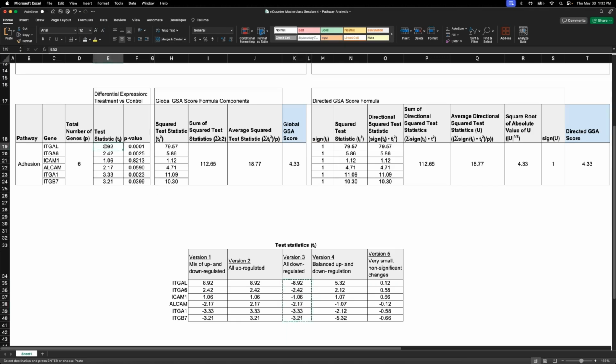So let me paste this in and show you. In this case, they're the same, but the signs are switched. So you remember the global score is independent of whether the genes are upregulated or downregulated. It just looks at all of the genes and says how much total evidence or how much change there is in the pathway. So we're not taking into account whether this gene is downregulated or upregulated. The value of the global score is always going to be positive, and it's because mathematically we're taking the square of the t. We're just squaring t. But on the right-hand side, we are taking into account, again, the direction.